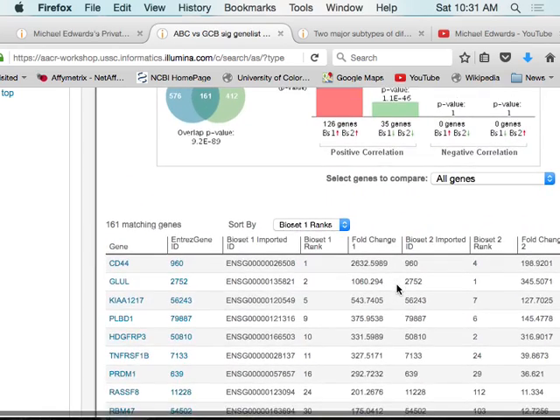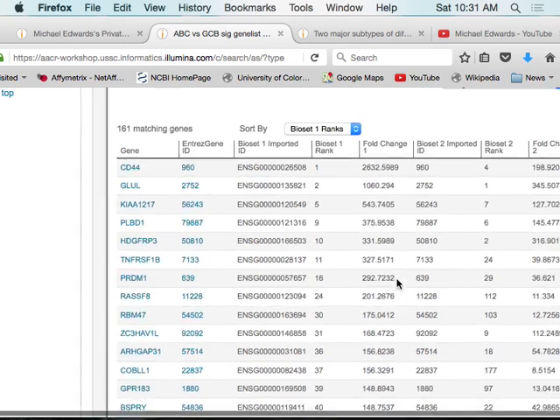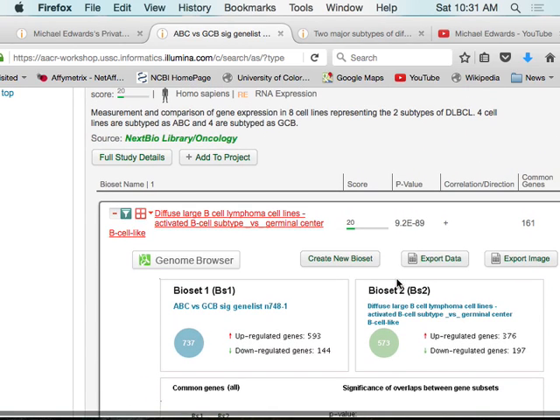But if our gene list was extracted out of that paper, why is there this difference? What did we do in our study? What did you guys do? When you were setting up your t-test, what happened? Oh, 0.05. No, you kicked one out, right? They used that crappy sample in their study.